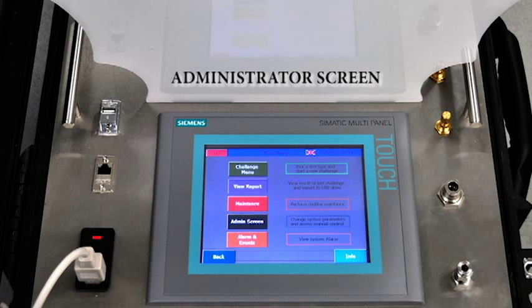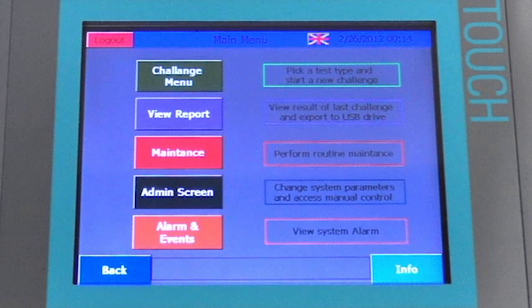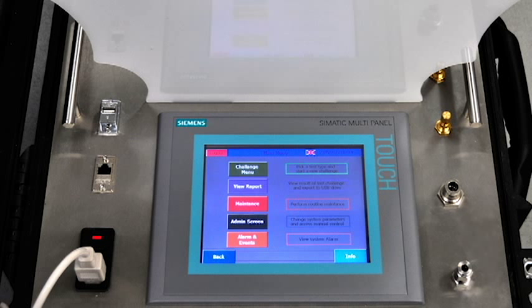The administrator station has an 8-inch Siemens touchscreen which can be used to monitor, set up, and conduct odor analysis. The results of the odor analysis are displayed live on this screen.